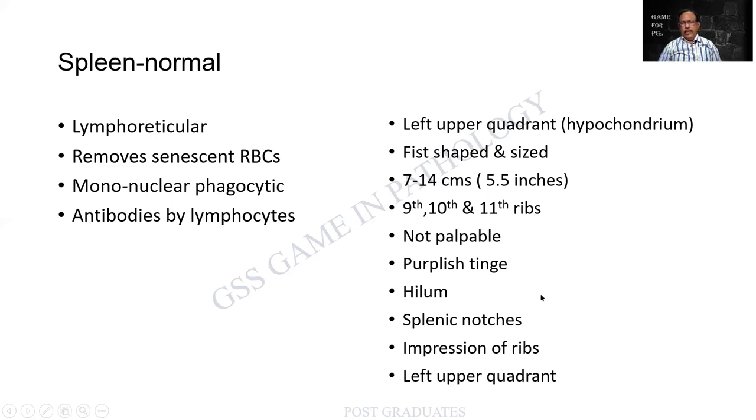So these are the important things, because the question to you people will be, how do you say it is spleen? You are not going to be given a normal spleen, but it can be an organ of enlargement. Obviously the question will go thus.